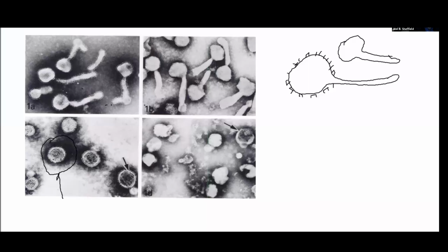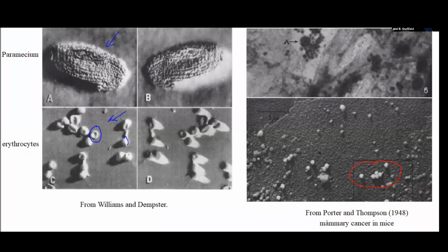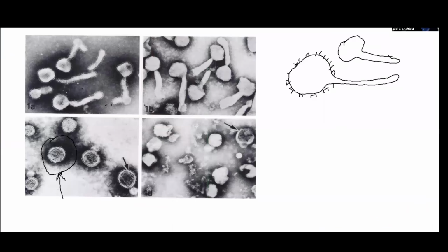And it turns out this is the structure that one sees in section tissues. It's the sort of structure that now, if I go back to this picture, that corresponds comfortably now with the sort of thing that Porter and Thompson saw, 30 years earlier. It's an interesting kind of path to have gone through. Okay, so I think I can stop here. Next time, I will be talking about looking at sectioned material and how we eventually can start to look through things.